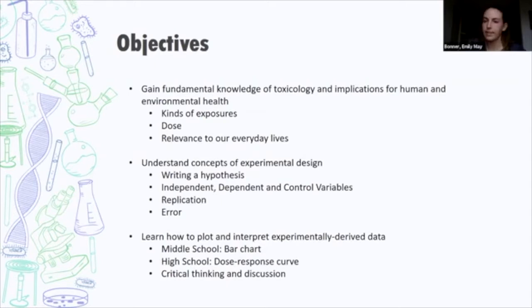And those activities and worksheets we'll show you a little bit later, but those do differ based on the level. So for middle school, their data analysis is a little simpler compared to the high school level. But both levels hopefully engage some critical thinking and discussion.